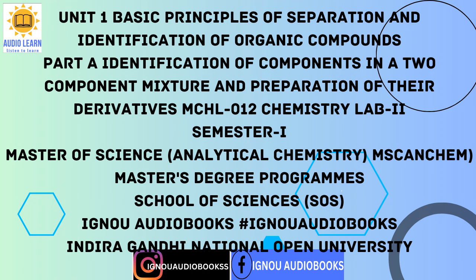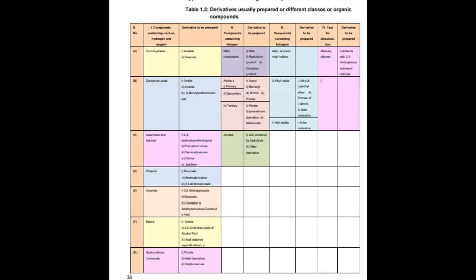This test is extremely sensitive since minute traces of halogen-containing impurities give this test. This test may also fail for very volatile liquids, since they evaporate before the copper wire is heated sufficiently to cause decomposition of the given compound. 2. It is also to be noted that certain compounds not containing halogen, for example, derivatives of quinoline, pyridine, organic acids, and urea, may also impart a green color to the flame.